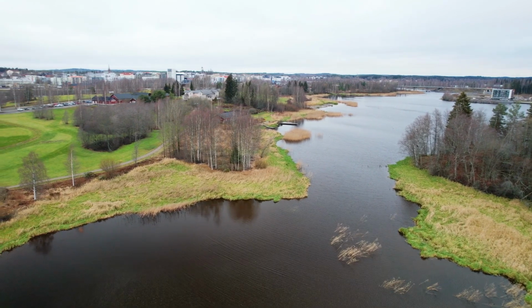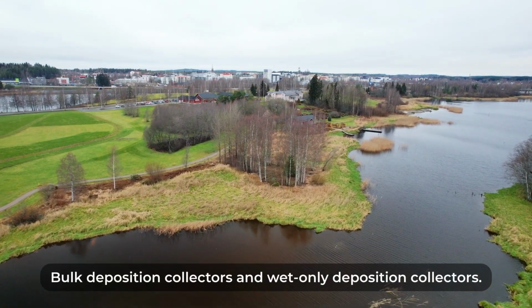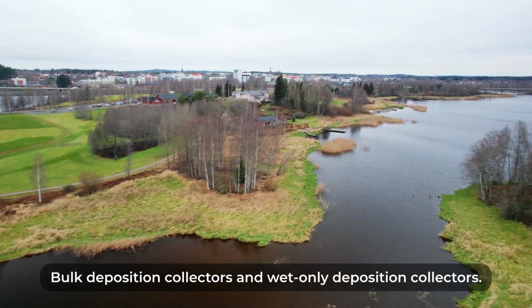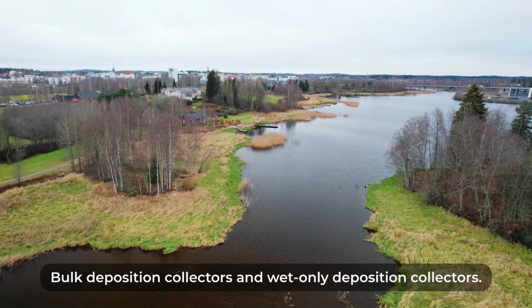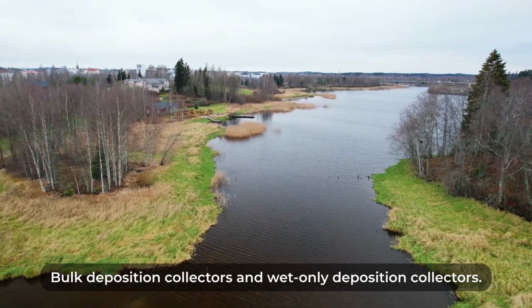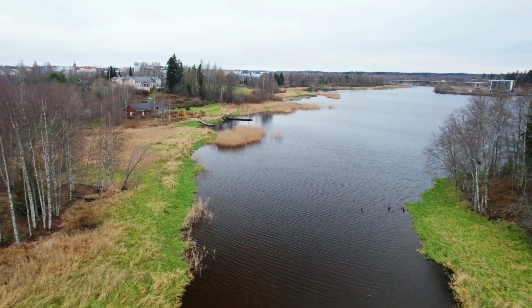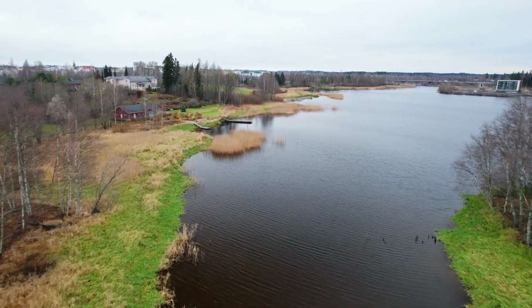Deposition collectors can be divided into two categories: bulk deposition collectors and wet-only deposition collectors. Bulk collectors collect both wet and dry particles, whereas wet-only collectors only collect wet particles, as their name implies. Both types of deposition collector also collect small amounts of non-sediment particles and gases.